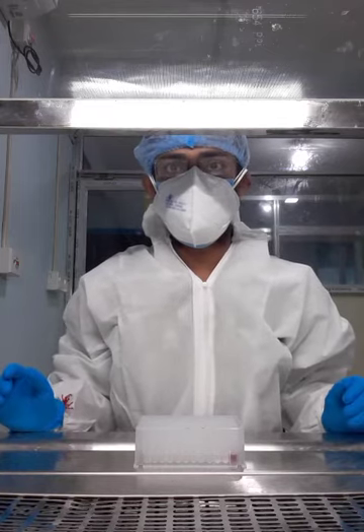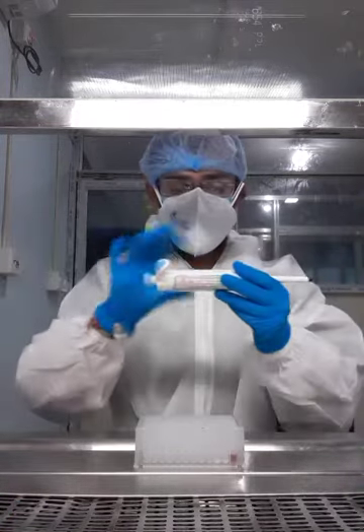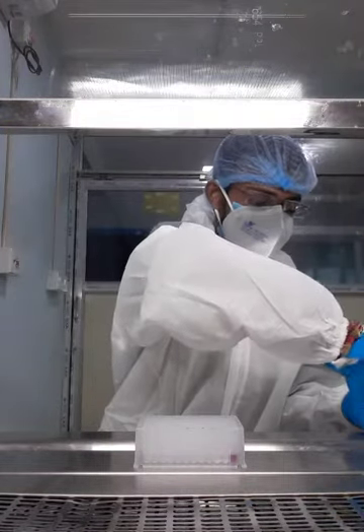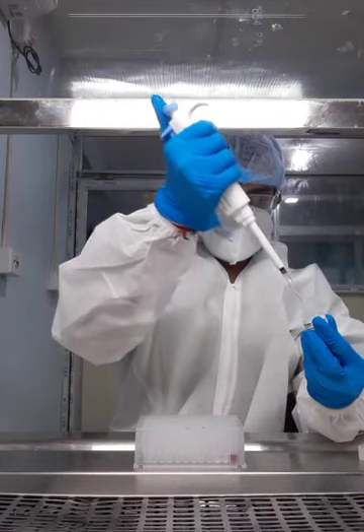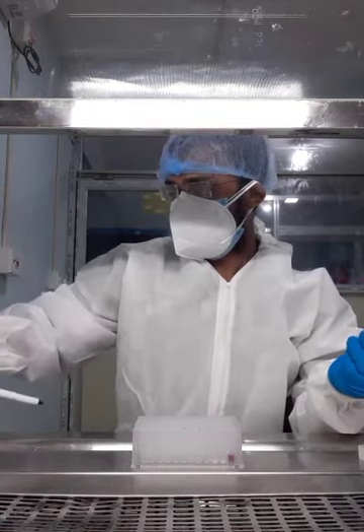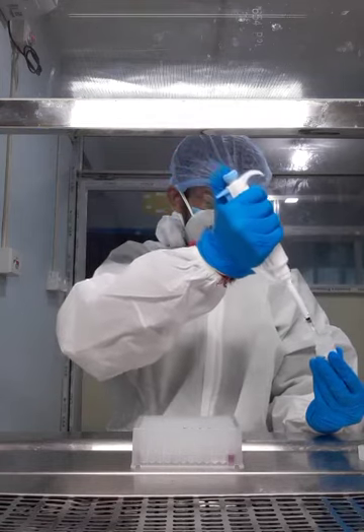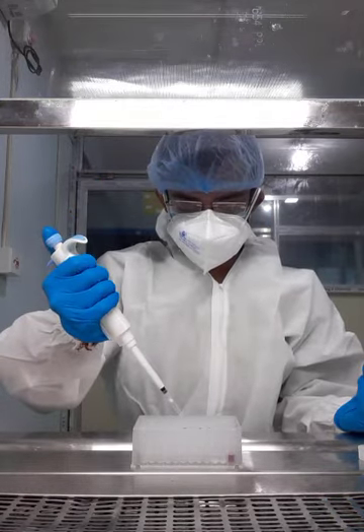Now my third step is to put 50 microliter elution buffer. This is the elution buffer I already showed you in my previous video. 50 microliter elution buffer in the sixth column of patient A, then dispose it. Again, I need to take 50 microliter elution buffer and place it in the sixth column of patient B.